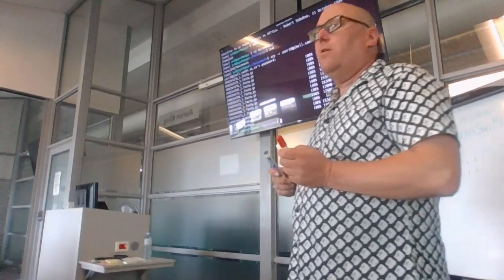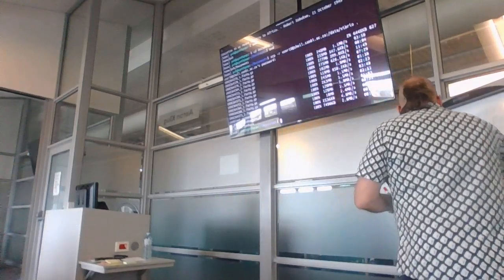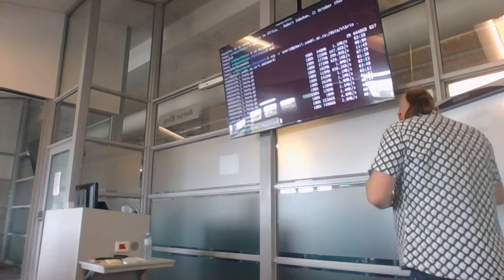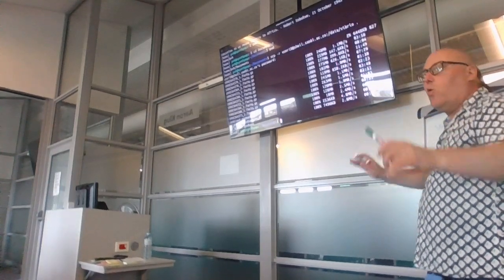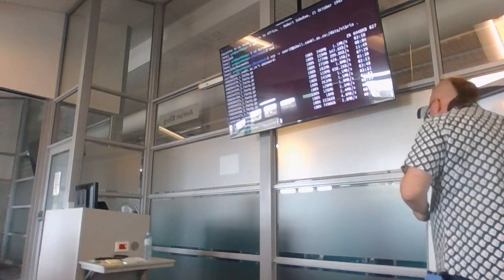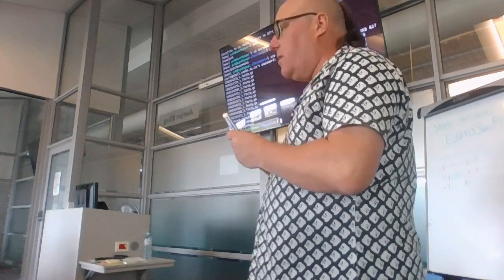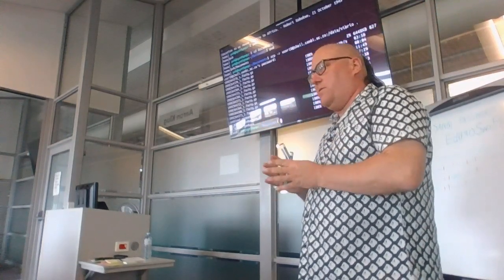Don't do what BaseSpace, the Illumina tool, did. I don't know if they've fixed it yet, but for a while I could recognize SARS-CoV-2 genomes assembled by Illumina BaseSpace because they would always put reference even if there was no data. And how could I recognize that? Because if I've got, let's say, an Omicron, then Omicron always has this pattern of mutations. All Omicron has these mutations. But instead of putting Ns where they didn't have enough coverage, they would put the genome as if it's reference at this position. They should put Ns, but they put reference. I did that once for a SARS-CoV-2 genome, and I'm still doing my atonement, and I'm still apologizing for having done that. One should never do that.